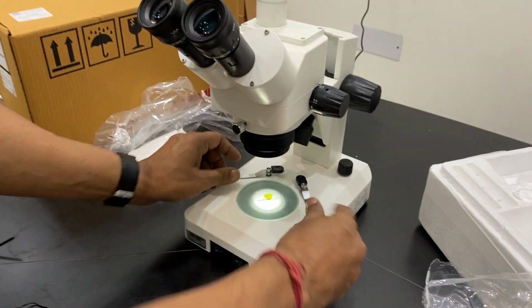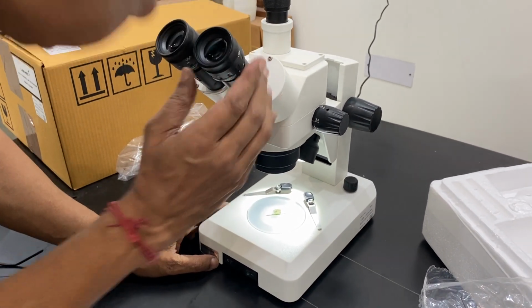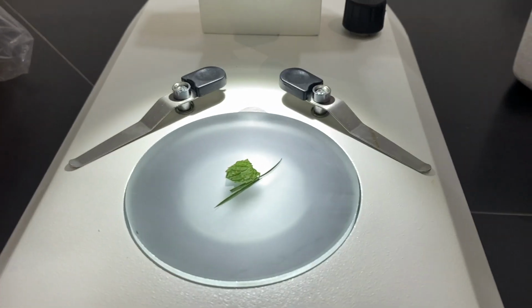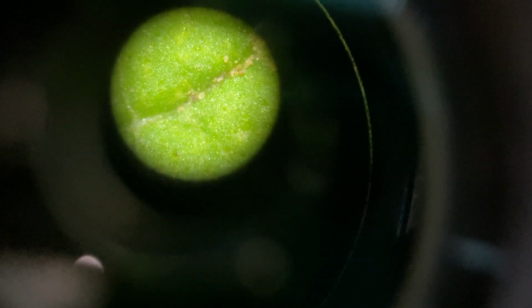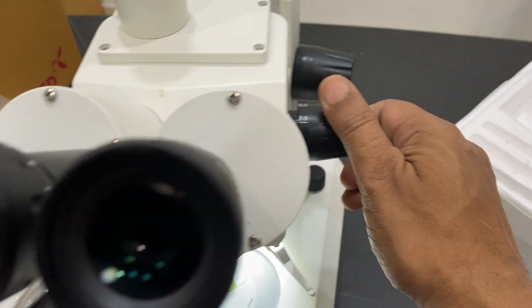These are the clips. And if there is a product which needs light from the top, here is the view again from the top. You can see the stomata. I am now using only the top light. I can show you the stomata on the top, and this view from the top is visible. You can see this. Now you can zoom from this knob. The image now has a zoom here. You can zoom and then click it, so that you see the view.